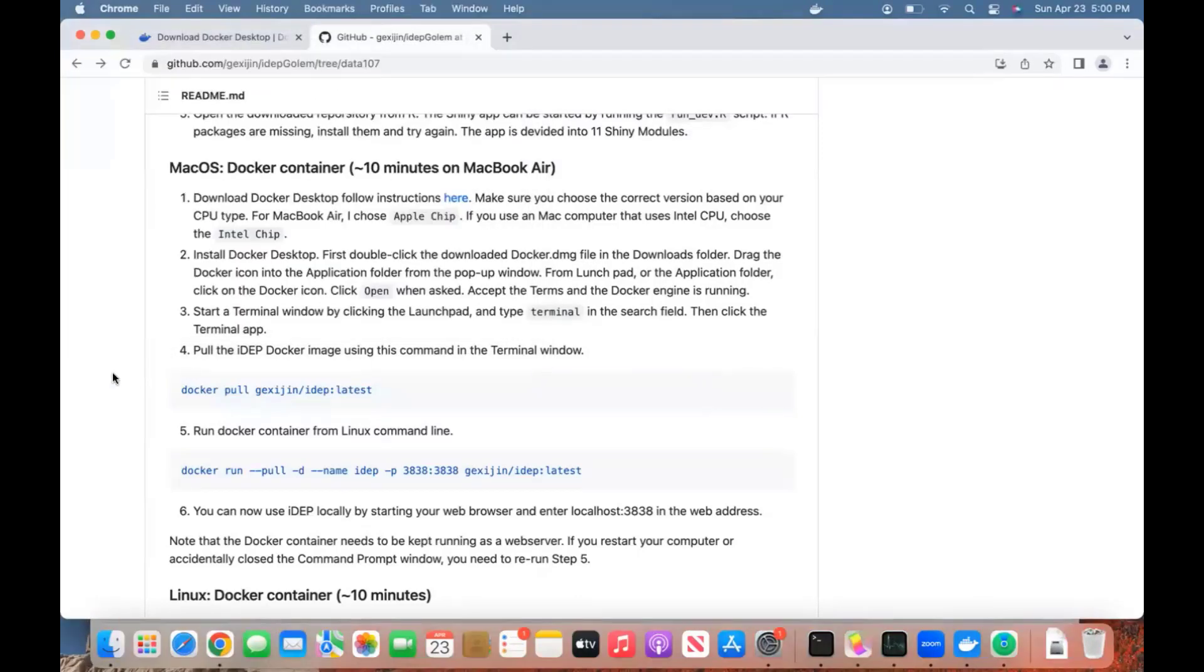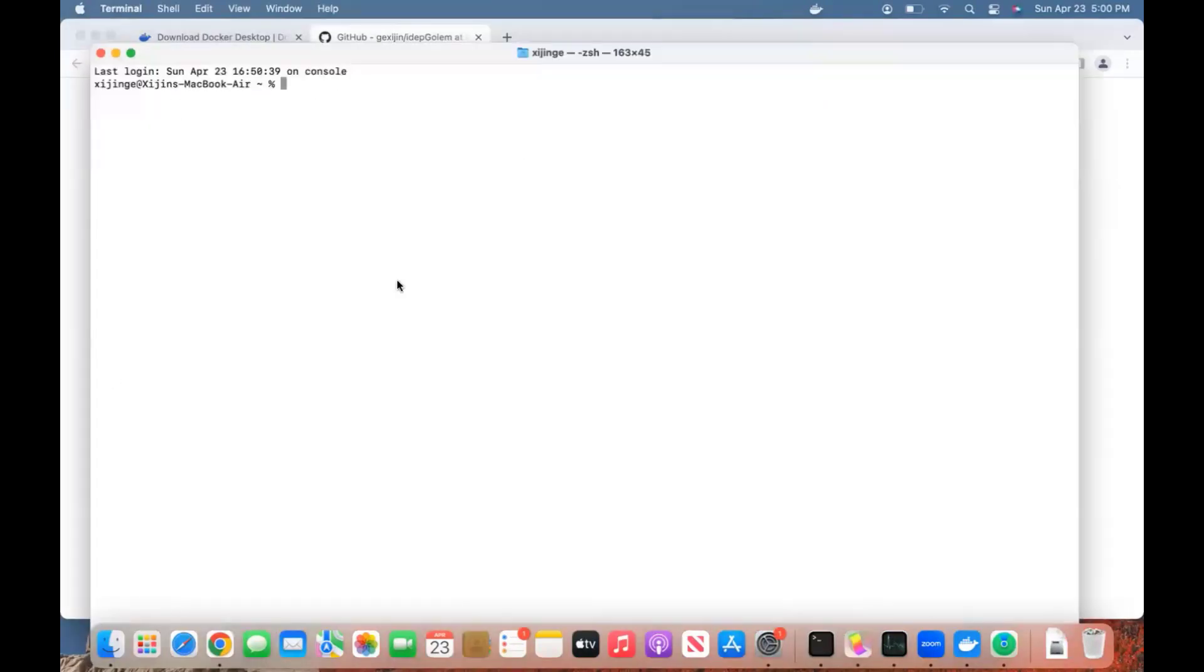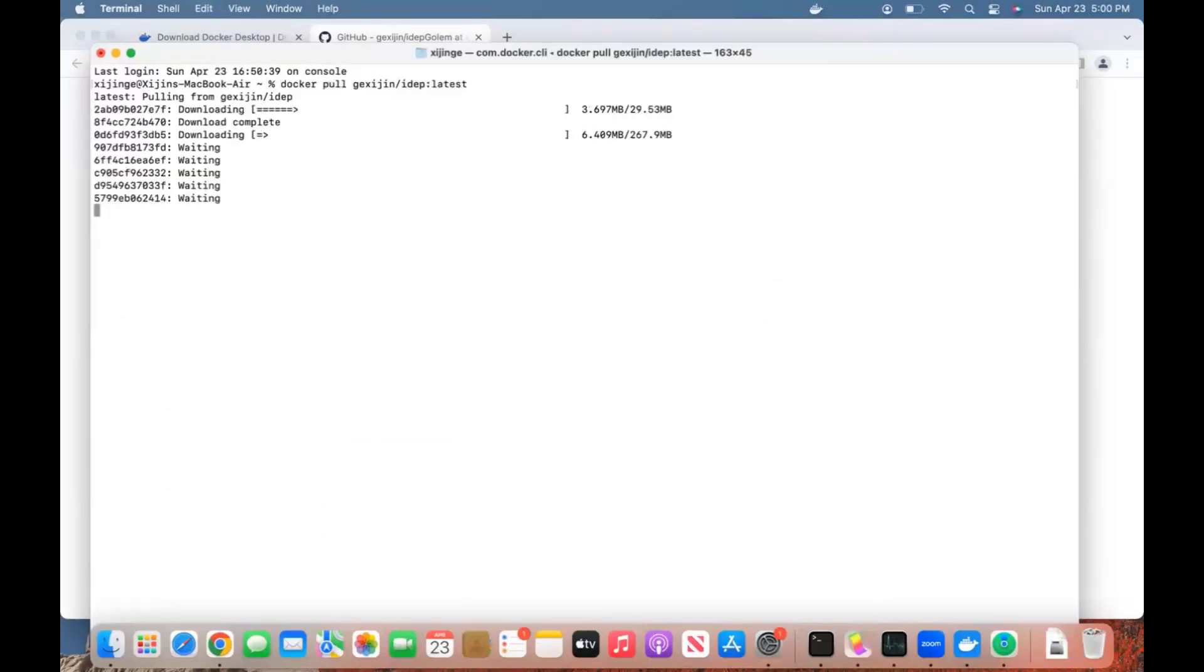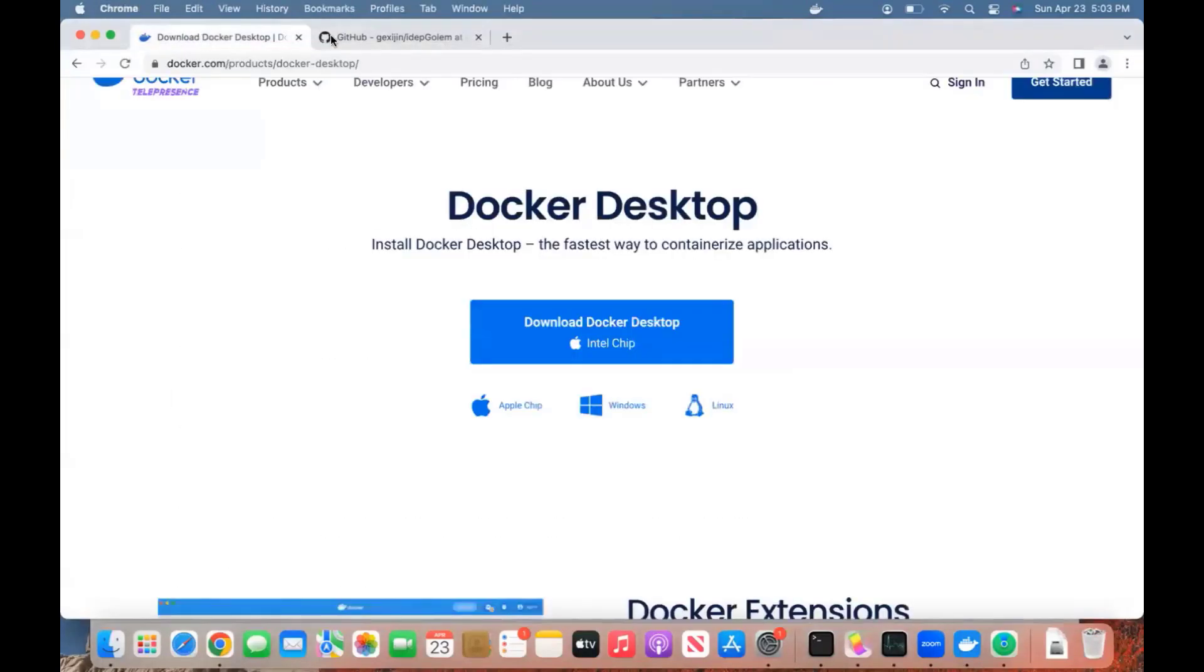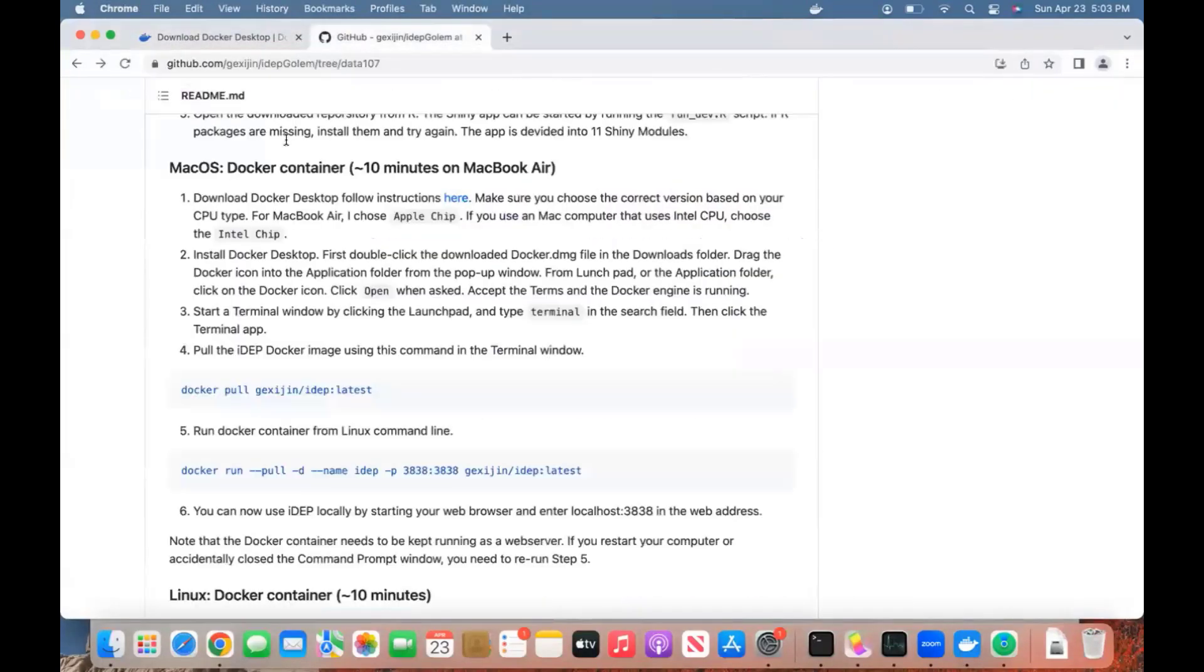We can copy this command to pull the Docker container. Paste it in here. Okay, finished. Now we're ready to run this Docker container from here.